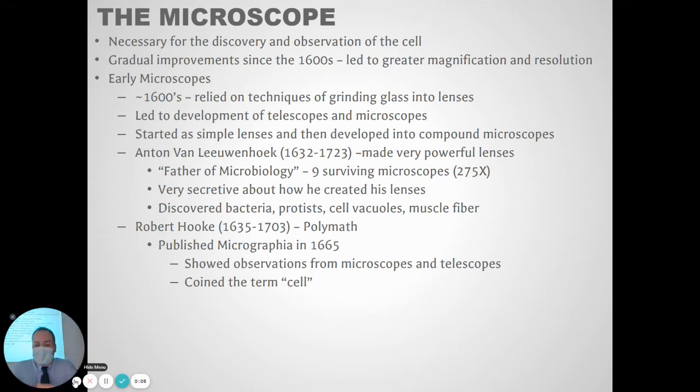So we're going to talk in this set of notes about some of the tools we use in biology, mostly focusing on microscopes. Microscopes were really invented, I would guess you would say, in like the 1600s.